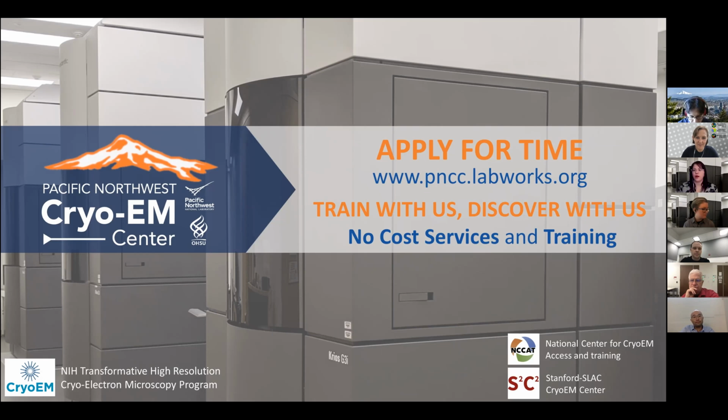Once approved, there's a recommended user onboarding with myself. PNCC offers both screening and data collection of single particle analysis and tomography on approved proposals. Additionally, each approved proposal will be delegated a SPOC, a scientific point of contact, whom they can ask scientific questions.